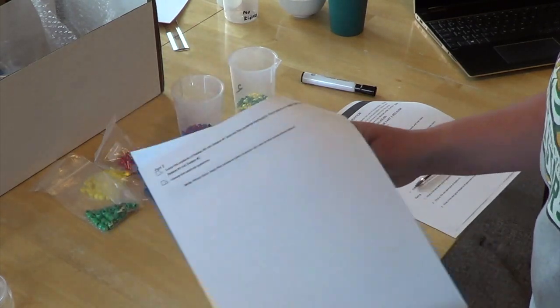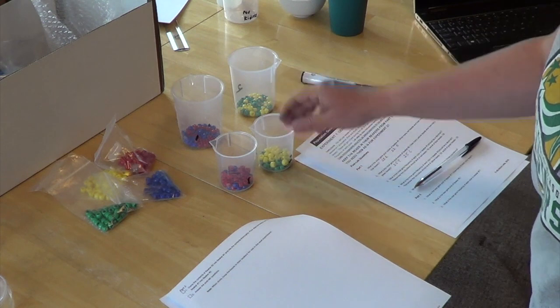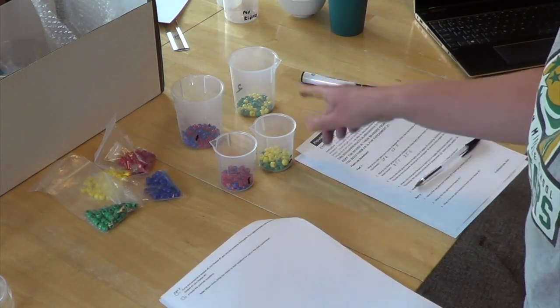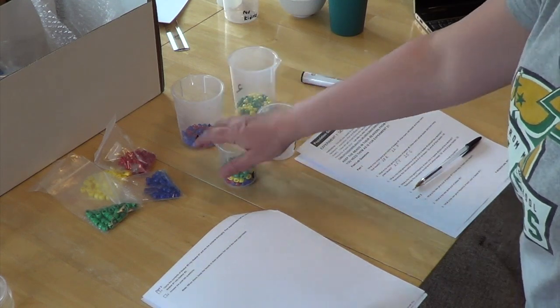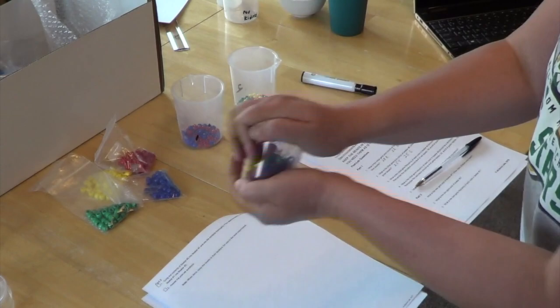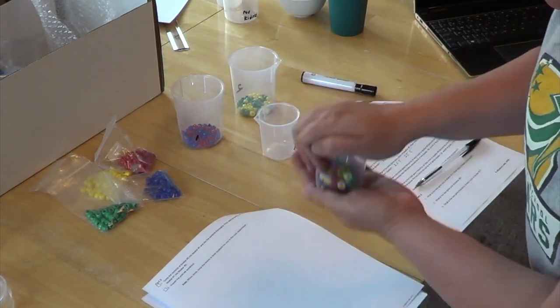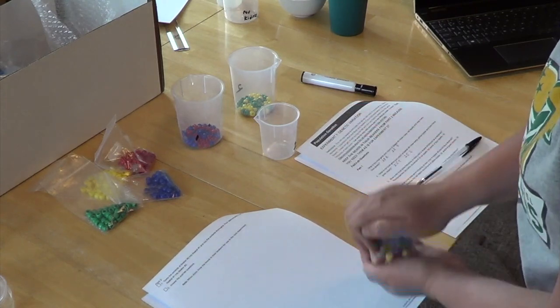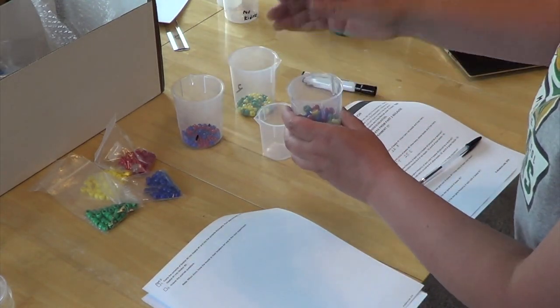In your instructions, it says dump the contents of beaker 2 into beaker 1 and mix thoroughly. So here we go. Okay, and I like to do a maraca mix, so that way they don't go anywhere. All right, so that's pretty mixed, and one's still in my hand.